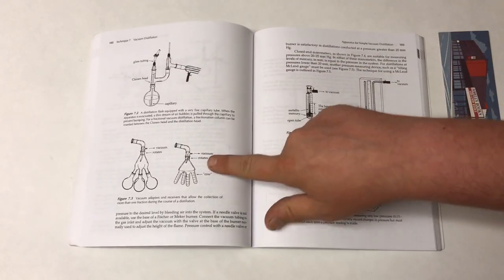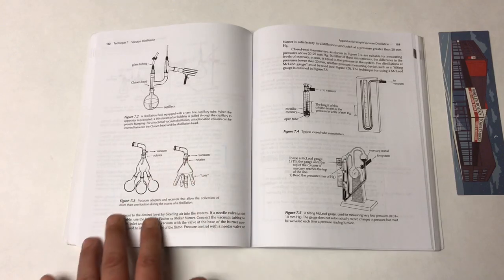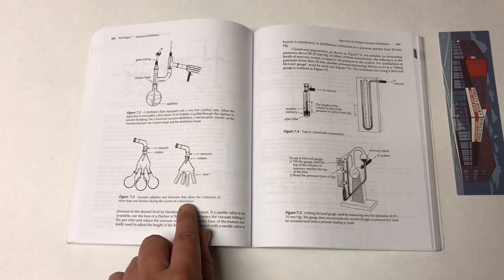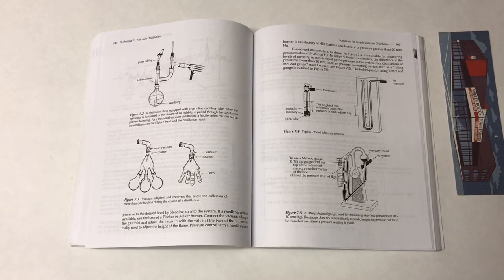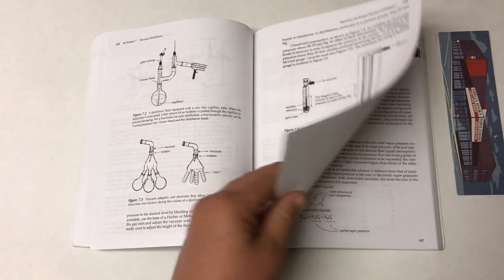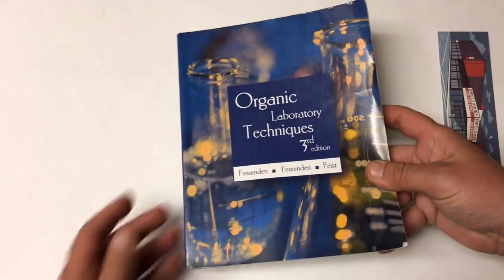So here it shows what a cow looks like. Vacuum adapters and receivers that allow the collection of more than one fraction during the course of a distillation. So in this case, we don't have to turn off the whole distillation in order to be able to just swing this cow to the next receiving flask. And this kind of goes on in a little more detail, but that's the basic gist of it.